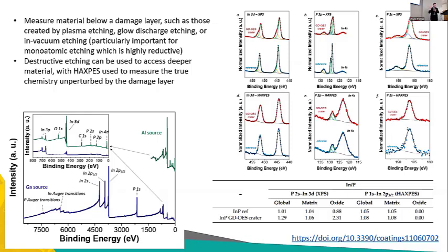And what's nice here as well is that we're using the deeper core levels of the phosphorus 1s and the indium 2p, which are incredibly strong, a greater sensitivity than XPS. I'll come back to that in a few slides. So actually the measurements are very, very fast.